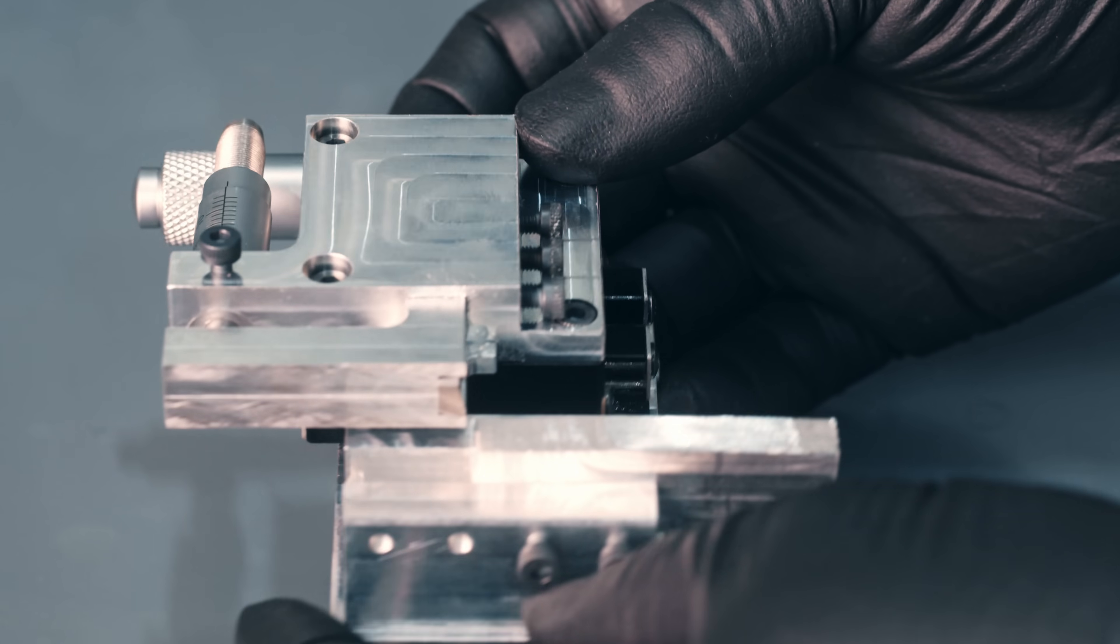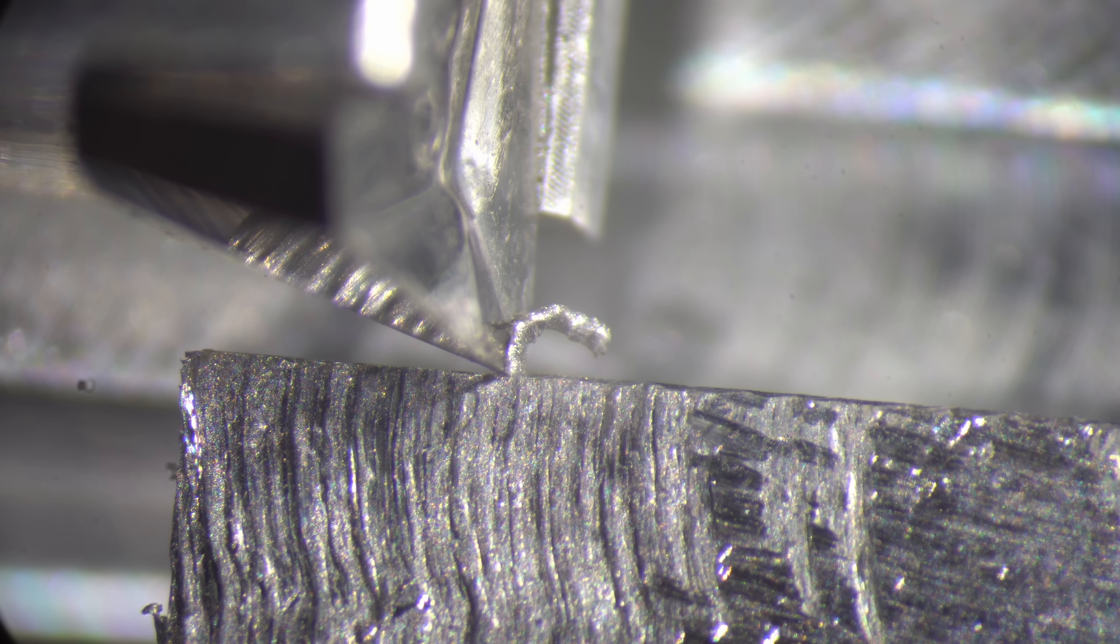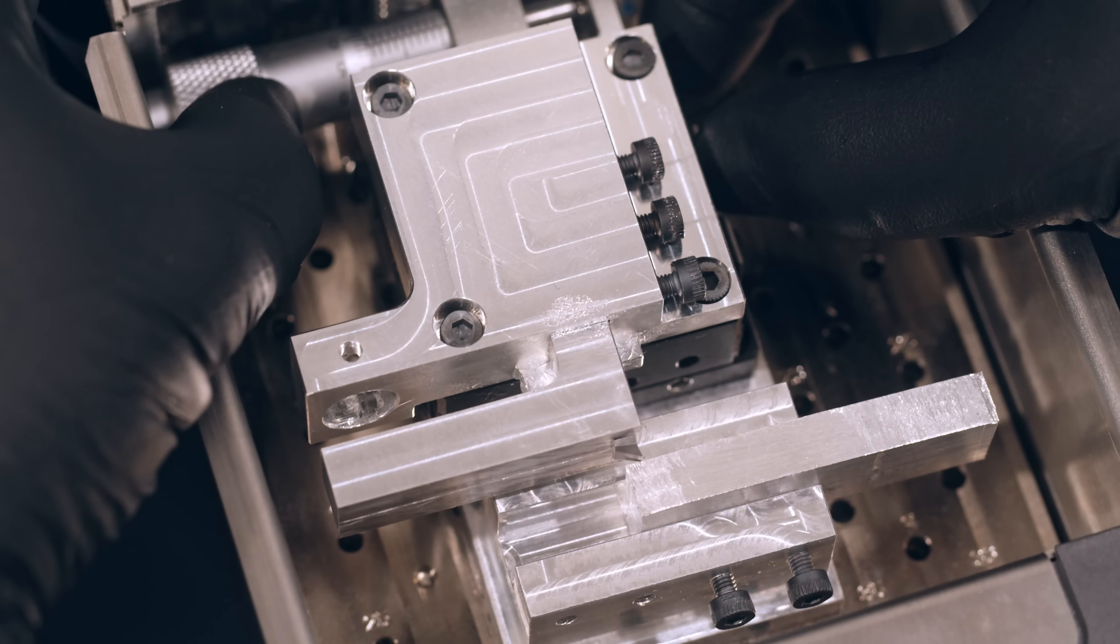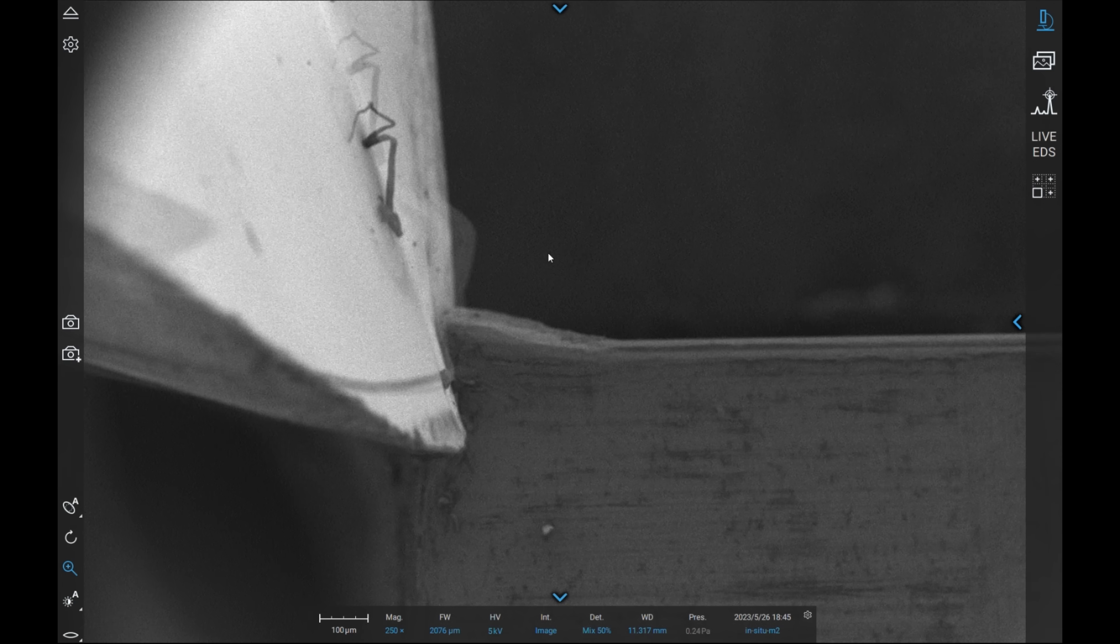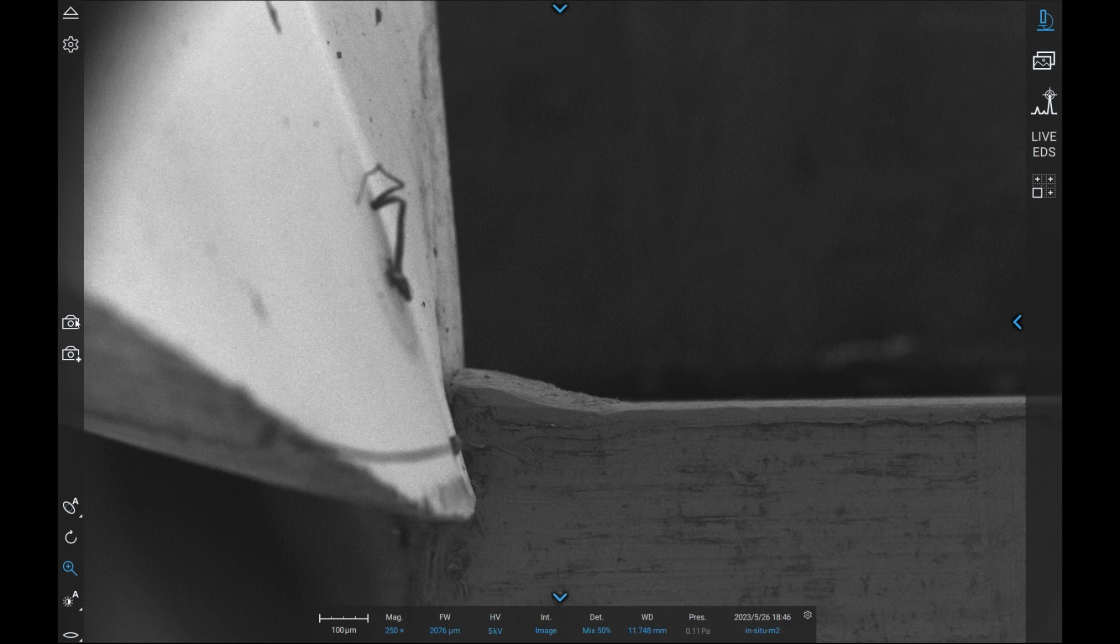I made this little widget which is designed to cut metal, but it's designed to do that inside of a vacuum chamber of a scanning electron microscope so that we can watch it happen in microscopic detail. And I have to tell you, this is some of the coolest footage I've seen in a long time.